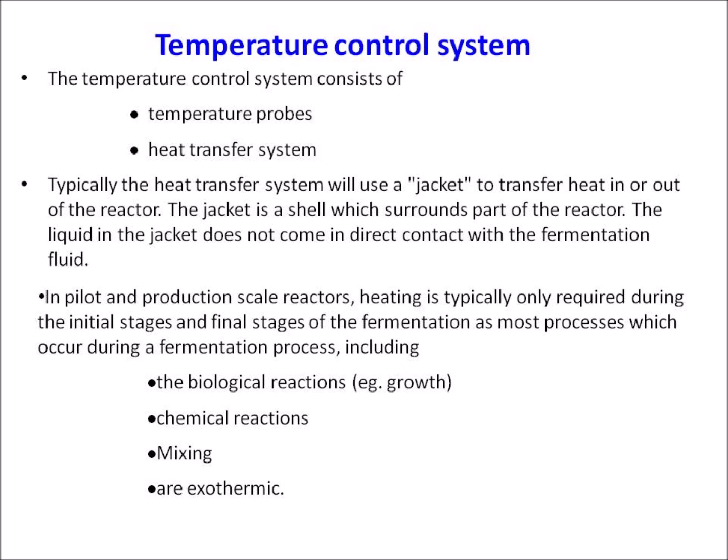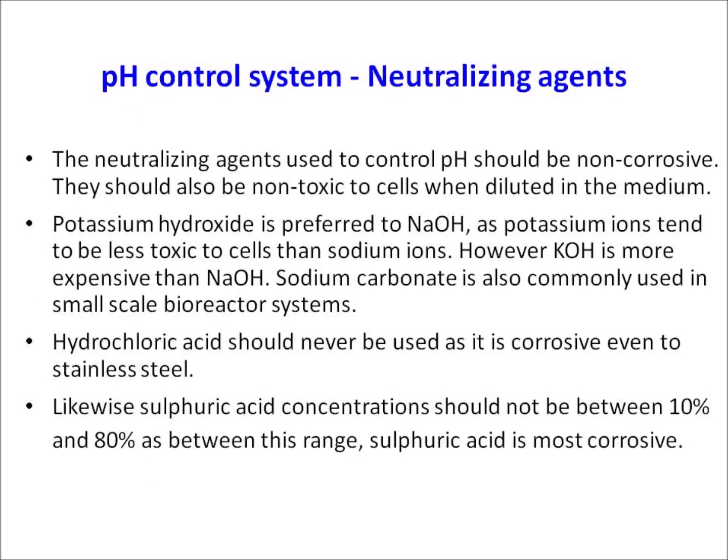In pilot and production scale reactors, heating is typically only required during the initial stages and final stages of the fermentation, as most processes which occur during a fermentation, including the biological reactions, chemical reactions, and mixing, are exothermic. pH control system, that is neutralizing agents.